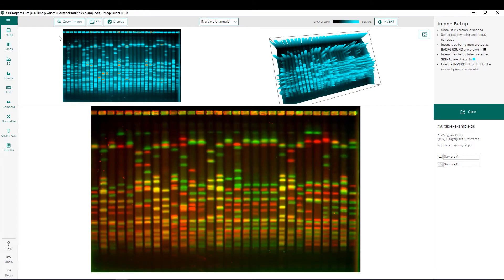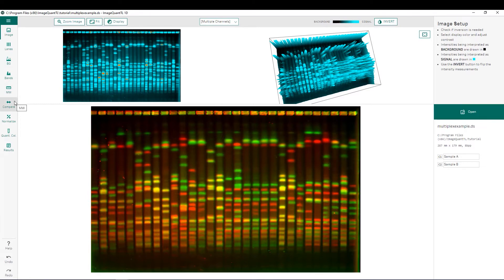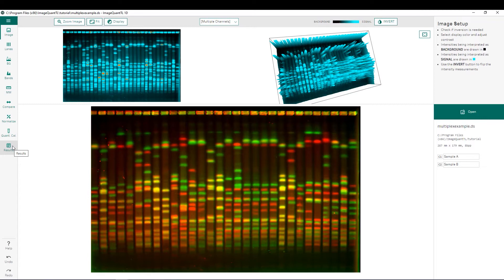Along the left side of our display we can see the different steps in the analysis workflow so we'll start by importing our image, next we'll do a lane creation where we're going to define our different lanes, we're going to do a background subtraction, we're going to define our bands followed by molecular weight determination, lane comparison, normalization, quantity calibration as well as reviewing all of our results.